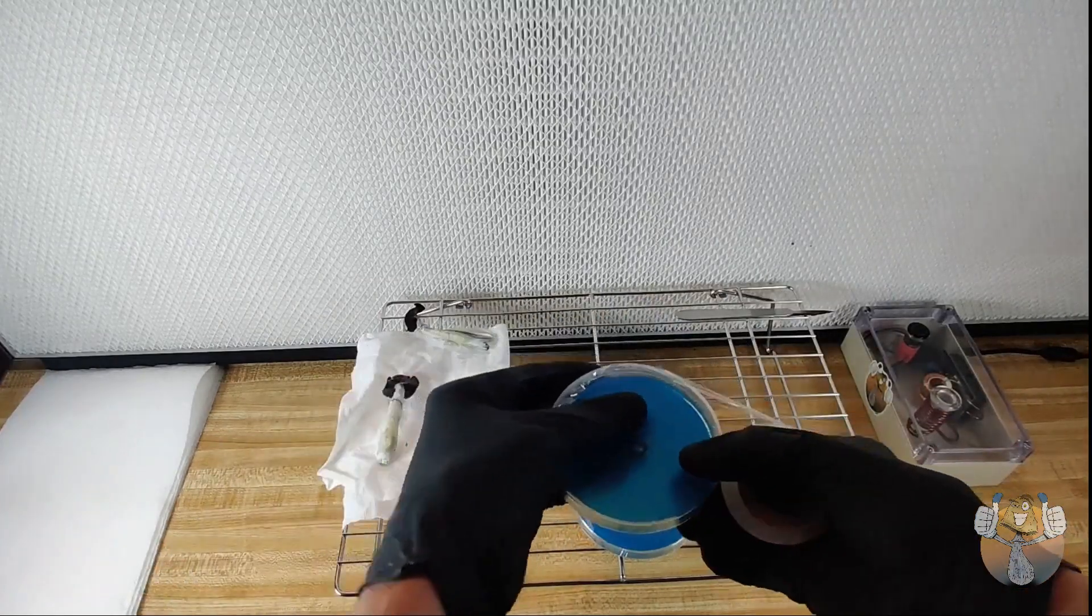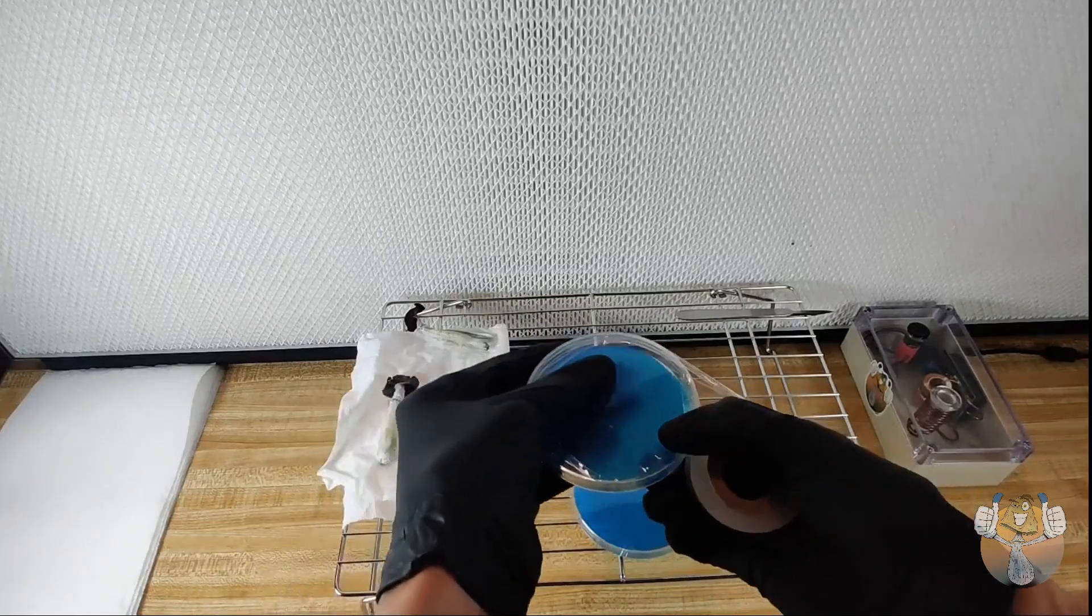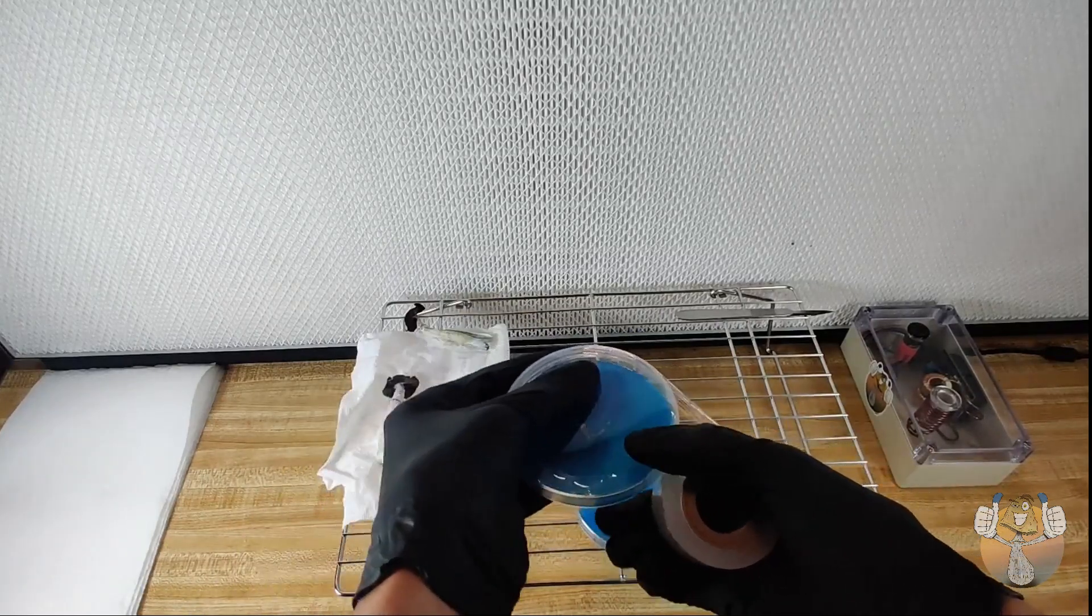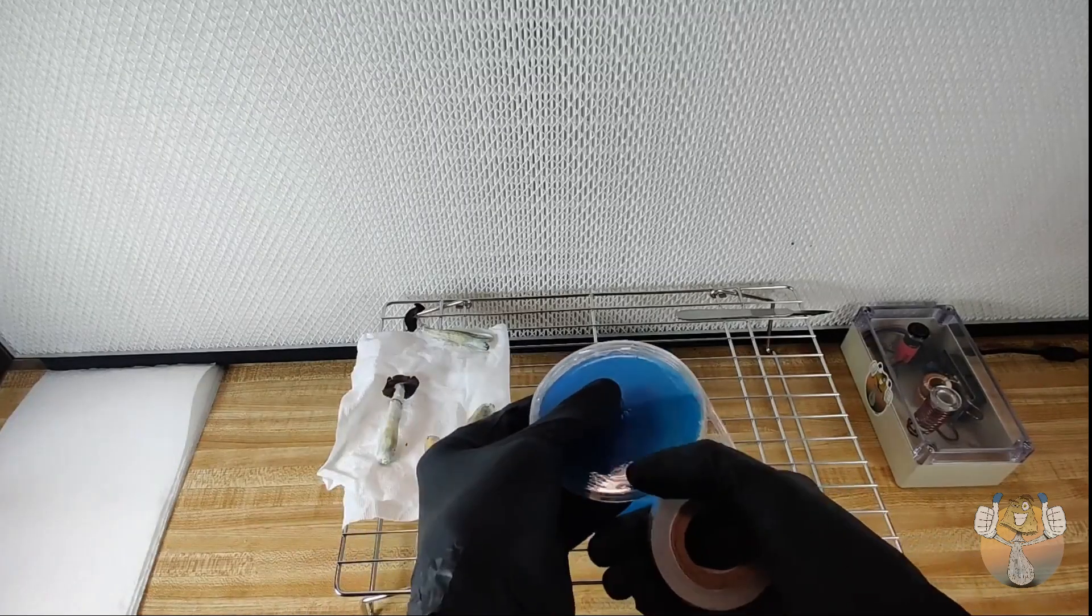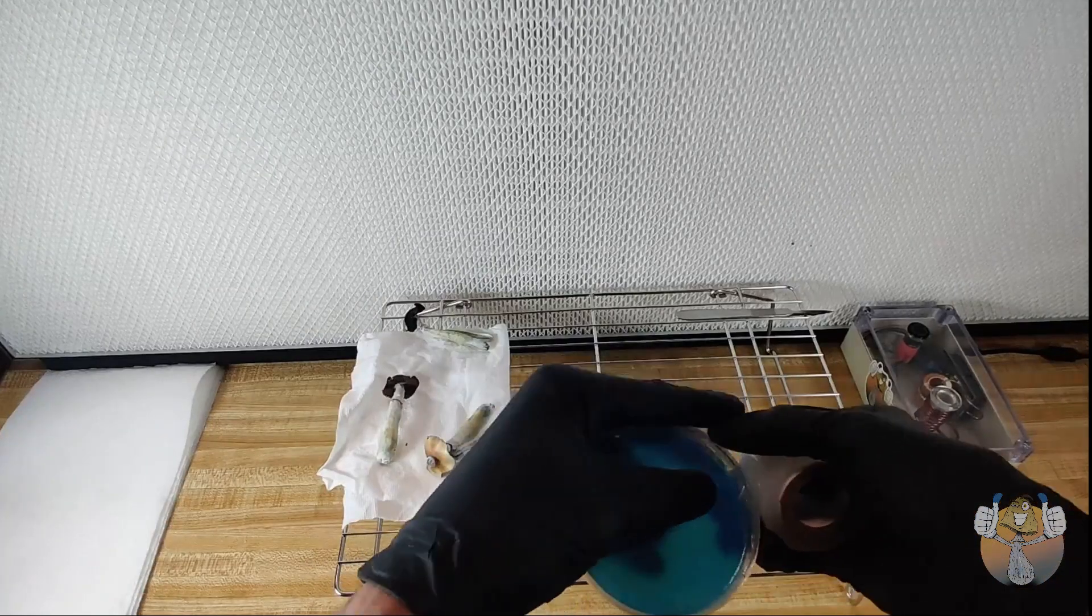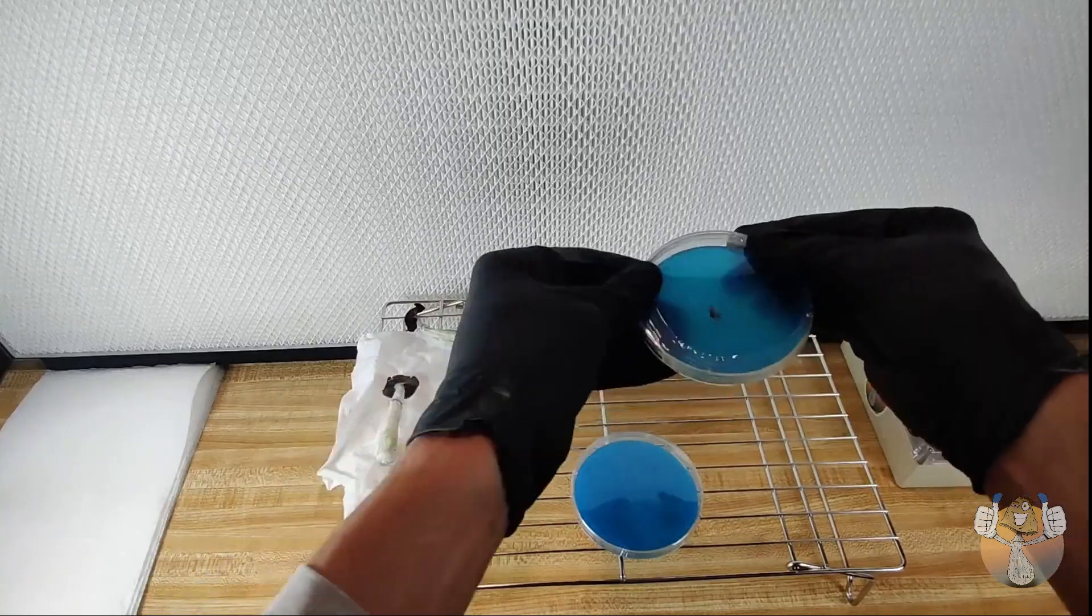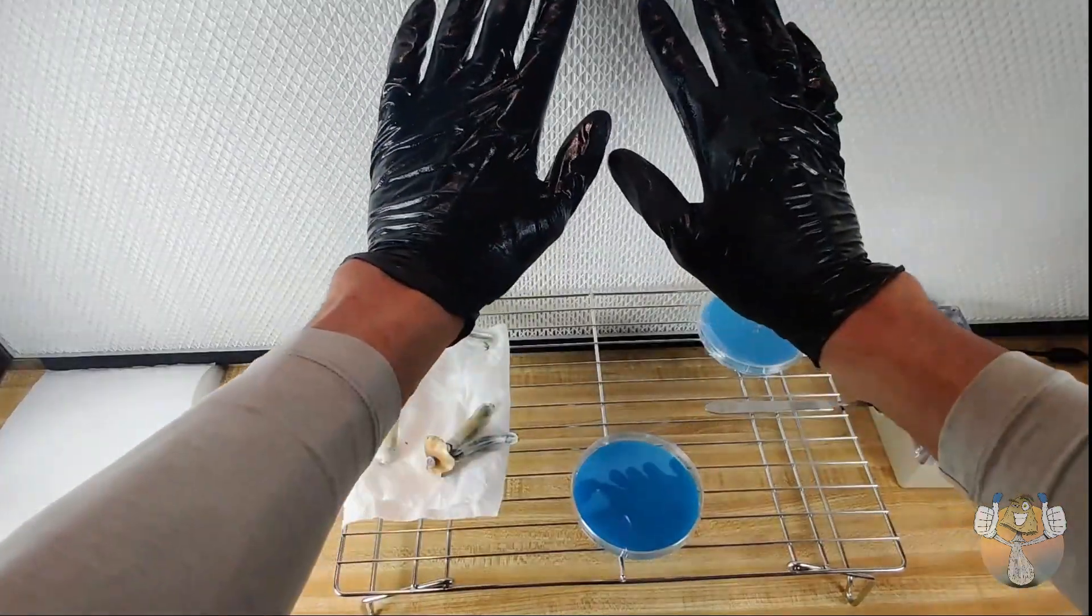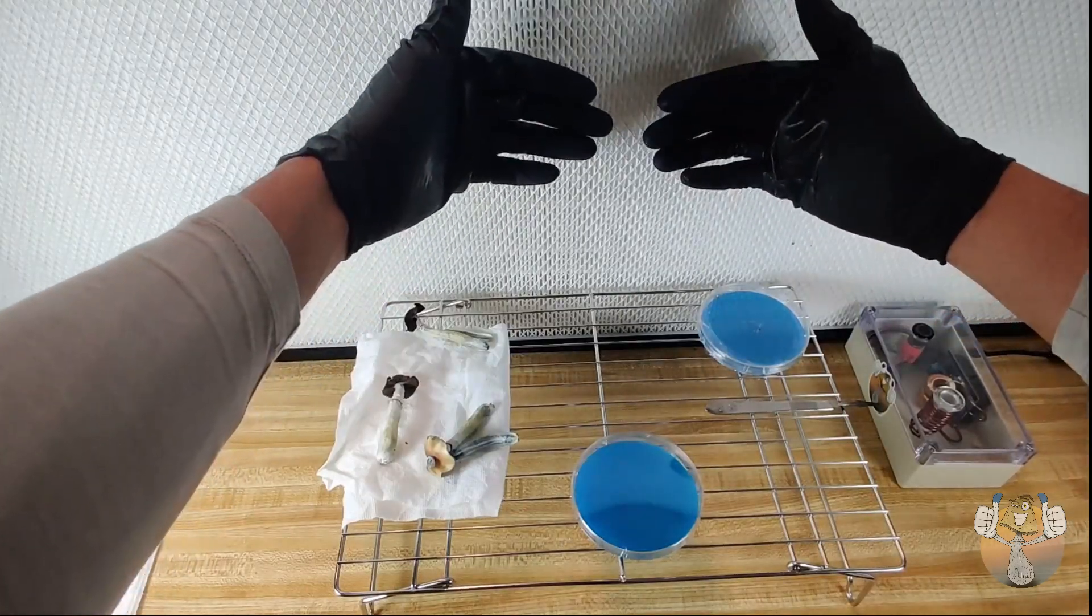And honestly, that is really all that it takes to clone your mushroom fruits. Once you're done, grab your polyfilm tape, tape down nice and snug. Don't forget to label, and you are good to go.